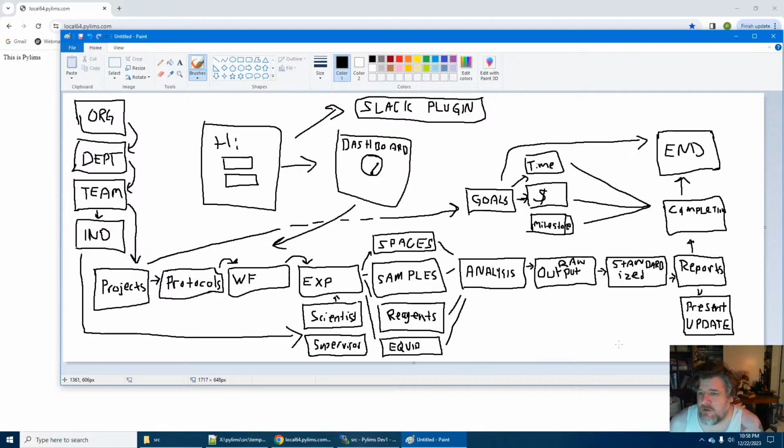Alright, so that's going to be the general kind of thing, and we'll probably add more stuff in there. That's going to be the general kind of flow of the site, or the software. And I'm sure that I will add more pieces or switch them around, but as far as I'm thinking, this is what I'm aiming for.